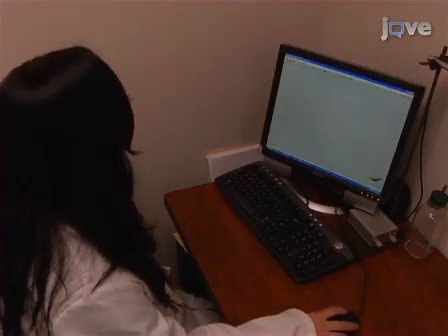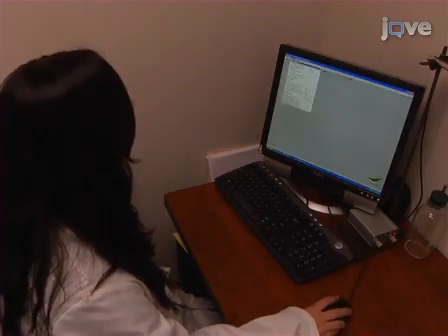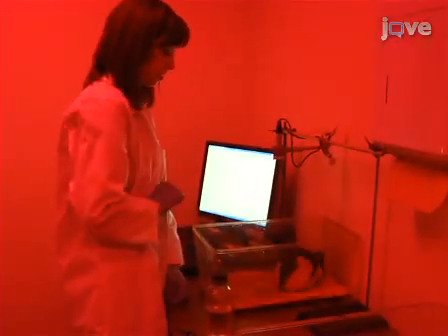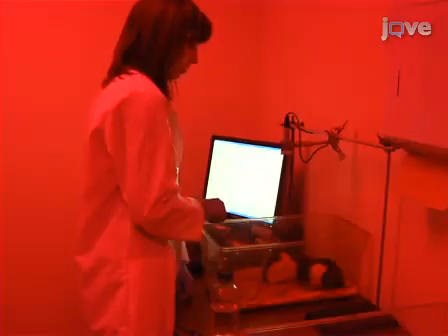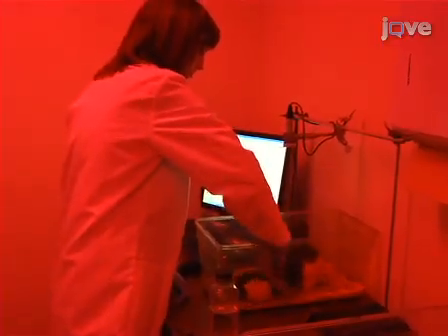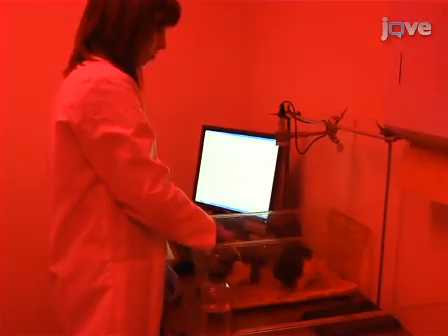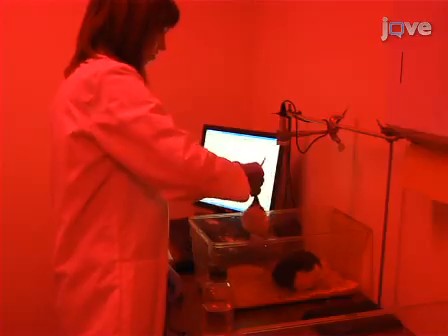Set up the Avisoft Recorder as shown earlier. Next, position the home cage underneath the microphone. Once the male is in position, introduce a receptive female rat into the cage. Remove the female once the male has shown interest in her and monitor for target vocalizations.